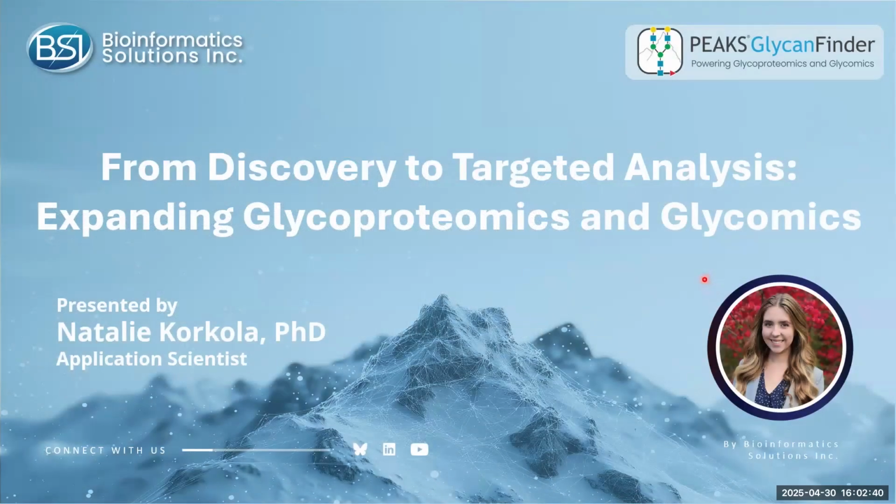Today my webinar is going to be all about Peak's GlycanFinder version 2.5.